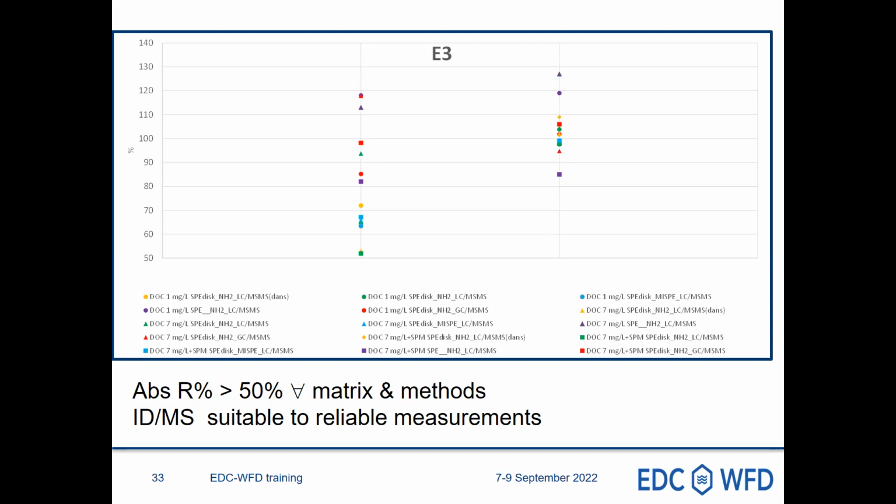So here, once again, you have each method with this color code. You have the definition of the different techniques, and you have here the absolute recovery, and here you have the relative recovery.